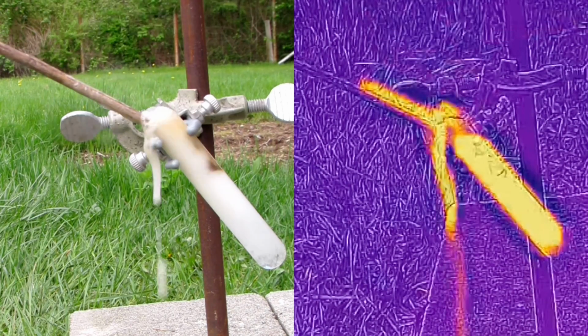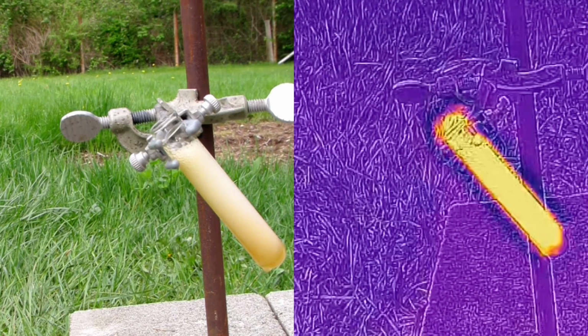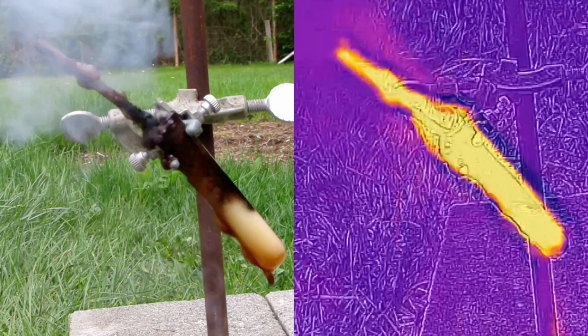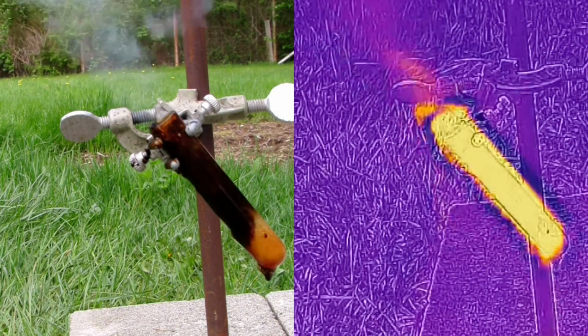Well, we certainly wouldn't want to waste this piranha solution. Peroxymonosulfuric acid is a strong enough oxidizing agent that it will oxidize organic compounds to carbon and then oxidize the carbon to carbon dioxide. Thus, it quickly annihilates this stick. What a great exothermic reaction.